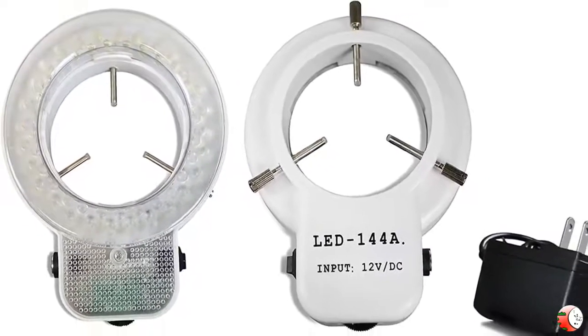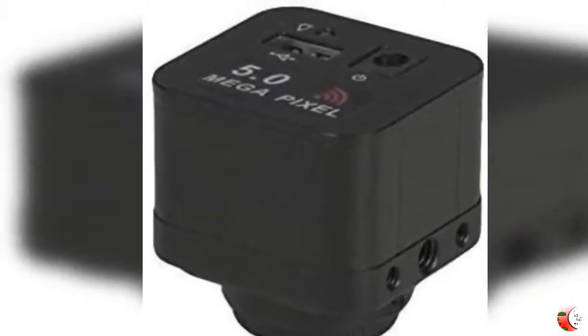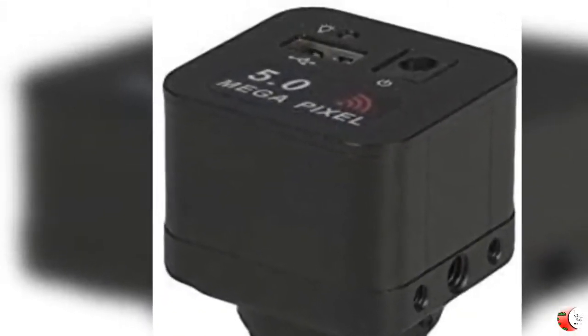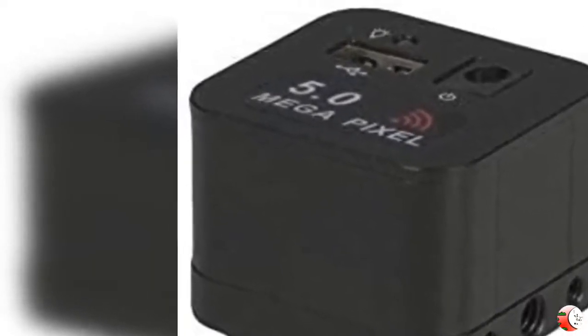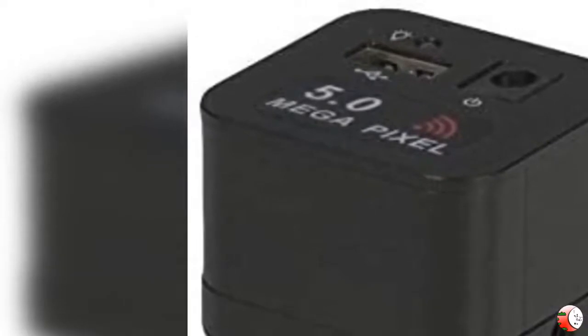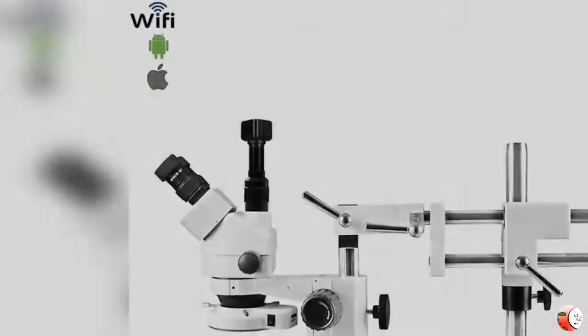2. 7x to 45x Standard Magnification Range, that when used with the included 0.5x and 2x auxiliary lens, expands to a 3.5x to 90x magnification range.